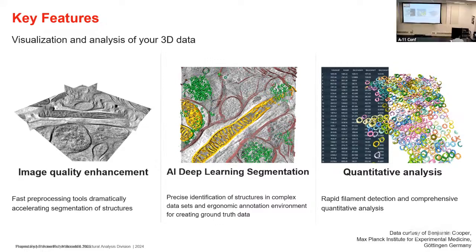I have a question also about the AI stuff. It looks like you guys are using labeled data. Have you tried any of the recent unsupervised methods, where you just give it the image, let the model figure out what exists in the image and do the segmentation?